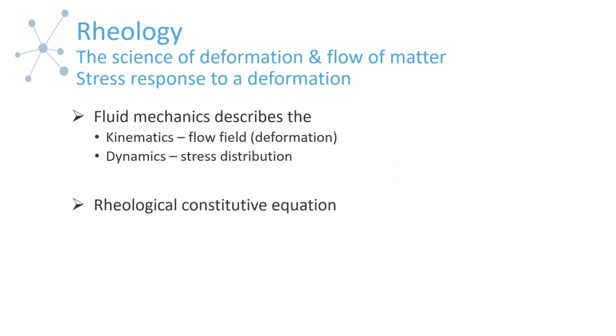So we need to combine these based on what we know, that we want to look at stress relative to deformation. So we turn then to what's referred to as the rheological constitutive equation. And this is just the big word that's going to give us the relationship between the kinematics and the dynamics, or the stress and flow.